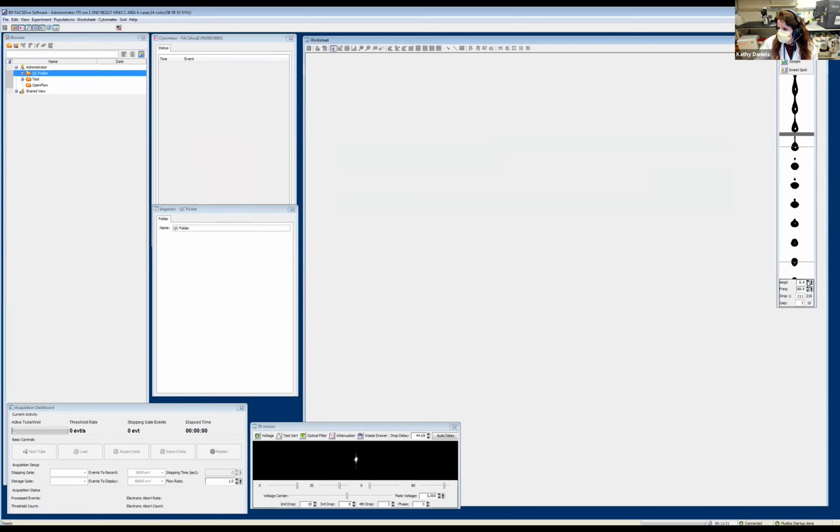If I increase this amplitude, the real value of the gap is going a little bit higher. So you can see it's at 11. I go up to 6.6. This gap is widening, and we see it reflected here because that is the real readout, okay?